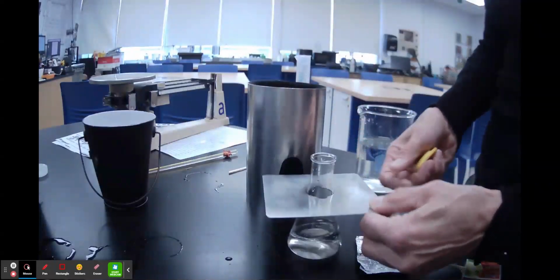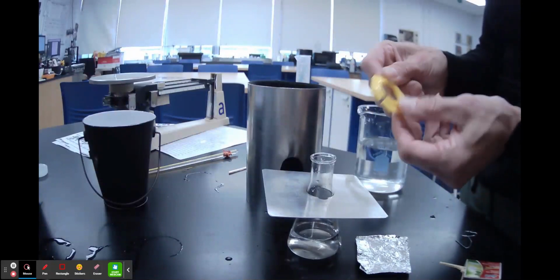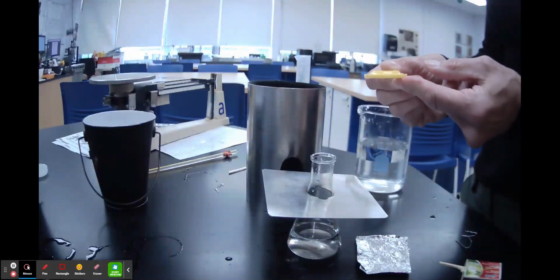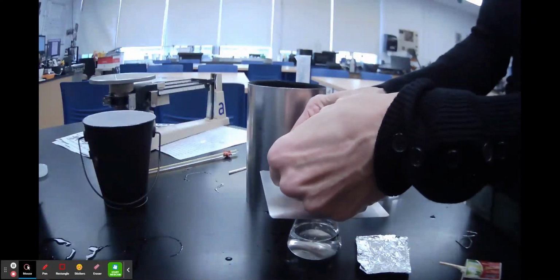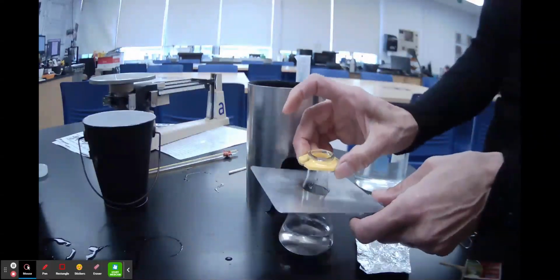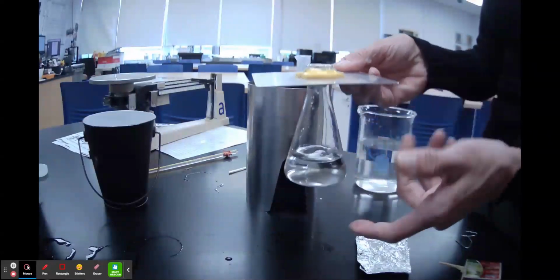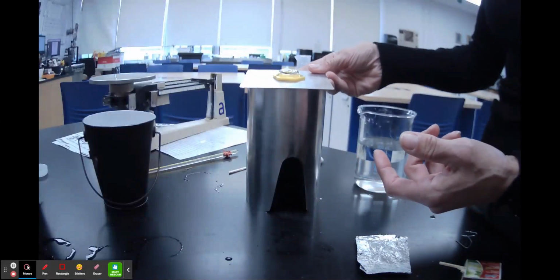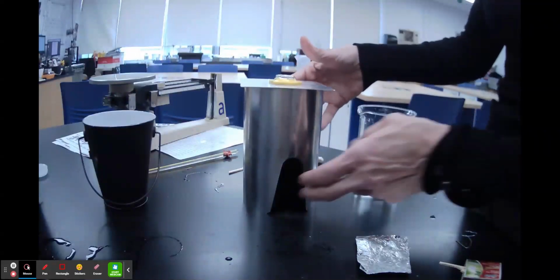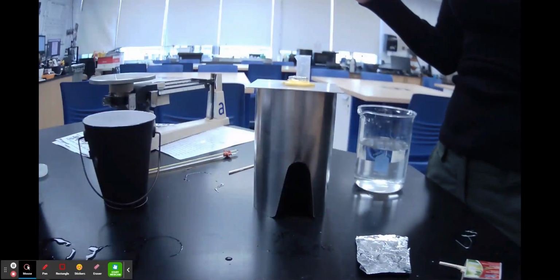Then you're going to place the metal top of the combustion chamber first. Then you're going to put the flat side towards the metal top. This holds the Erlenmeyer securely above the burning piece of food. You're going to place the Erlenmeyer inside the combustion chamber, making sure that the lid covers the entire top. You don't want any heat escaping through a gap between the lid and the combustion chamber.